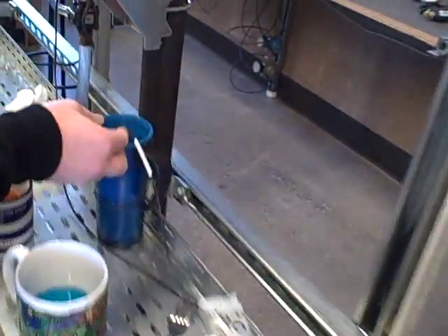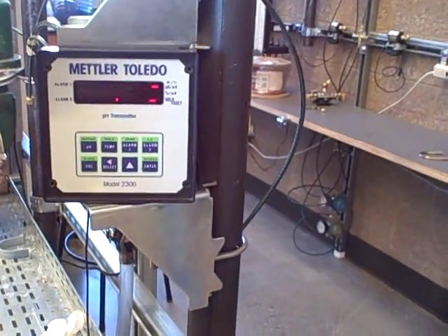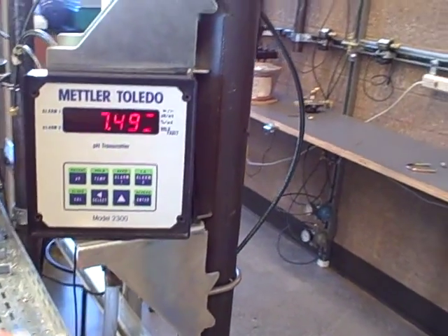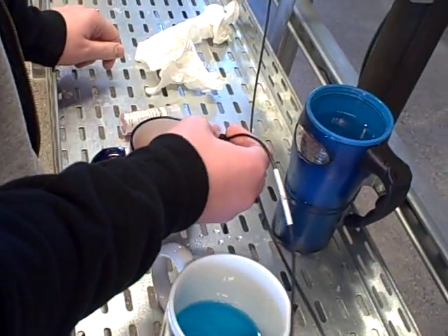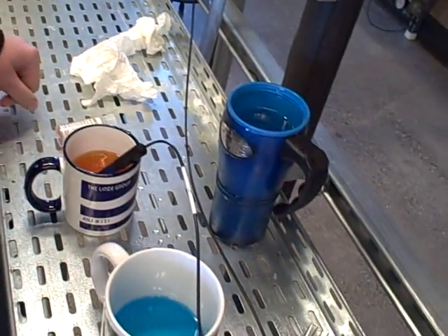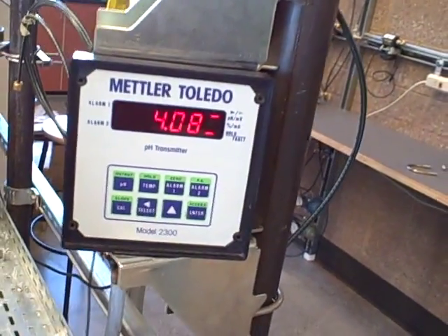First thing I'm going to do is push the hold key twice to get into calibration mode. After I get into calibration mode, I am going to place my pH meter in the first buffer. This has a pH of 4, so hopefully my meter goes down to around 4 if it's properly calibrated already.